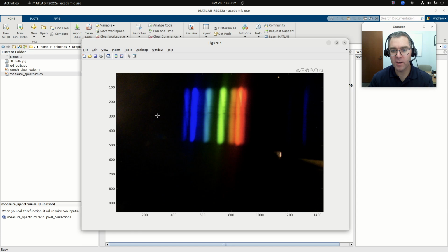What I'm going to do here is construct a horizontal line across my image, from the left edge to the right edge. I want to position my cursor as close to the center of my bands as possible to cut through them. Mine looks like it's somewhere around 300. It's a little tricky picking the left edge, because if I'm off my image, it won't select it, so I want to be close to that edge.